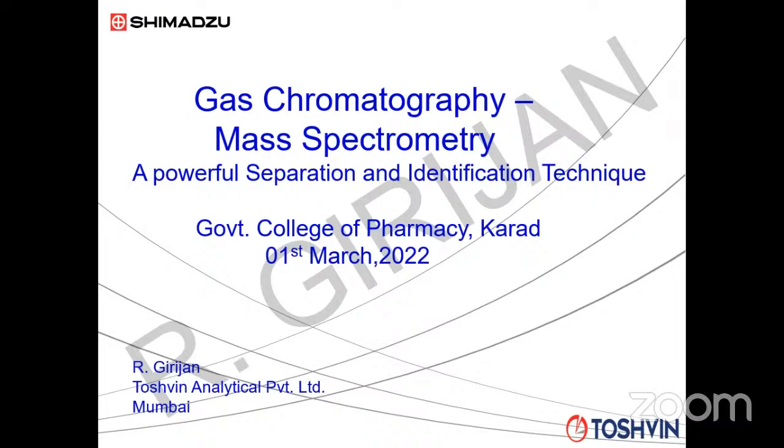So specifically when you talk about GCMS or LCMS, the chromatography part, the GC part or the LC part, is responsible for the required separation of the compounds present in the sample. And what is the mass spectrometer doing? It is only doing the identification of the separated compounds. So when we talk about a hyphenated system like GCMS, we are coupling two different techniques together. One is an identification technique and one is a separation technique. GC is responsible for separation and MS is responsible for identification.